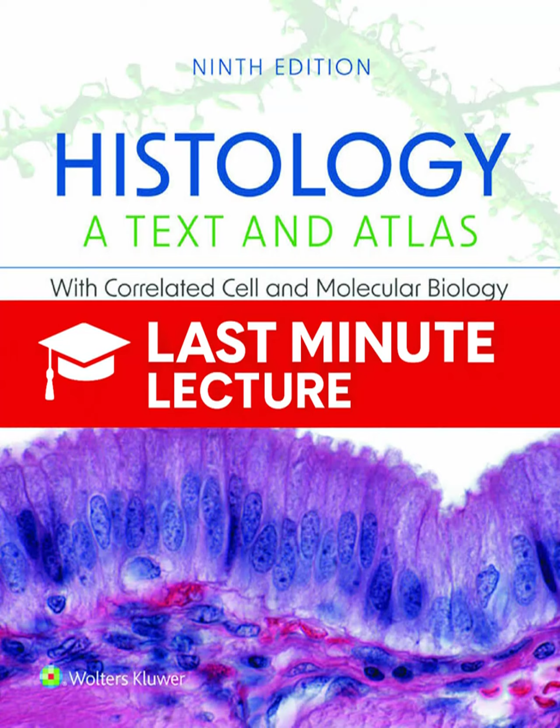The living cells take up this radioactive precursor and build it into new macromolecules. Then you fix and section the tissue. And how does that radioactive tag become a visible image? This is the clever part. You dip the slide in a melted photographic emulsion, basically coating it in a layer of undeveloped film. Then you wait. Over days or weeks, the radioactive emissions from those tagged atoms expose the silver halide crystals in the emulsion. So it's like the cells are taking their own picture.